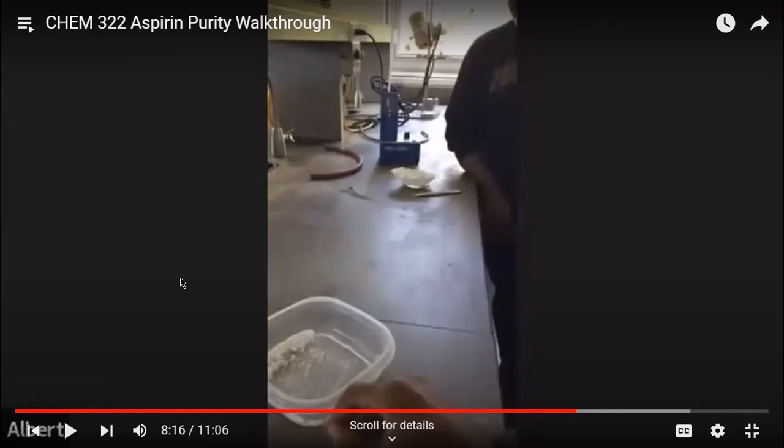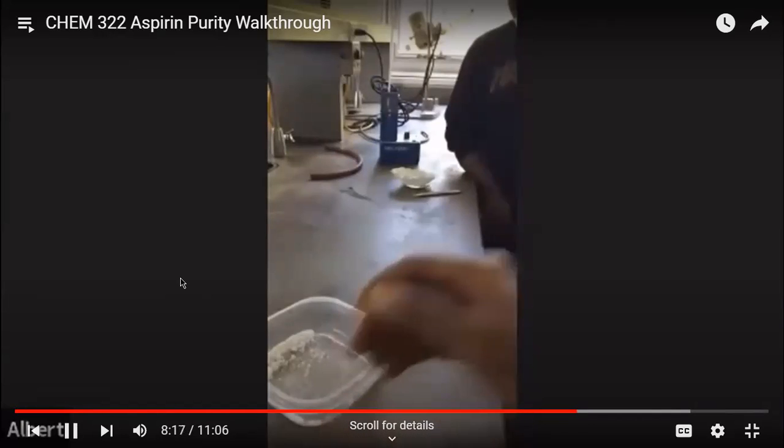So you want about a 1/2 centimeter of sample in that capillary before you put it into the melt temp. You want to have it about 1 centimeter, maybe a 1/2 centimeter from the bottom. That way, when you put it into the melt temp, you can actually see it. That's the purpose for the amount. Right, so y'all see how that got to the bottom? Just by a little finesse and a little tapping.